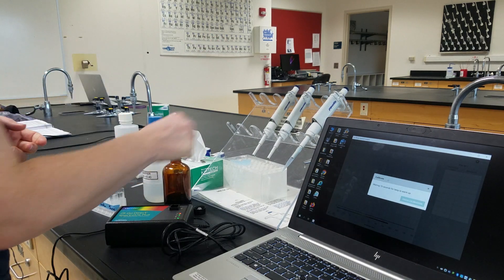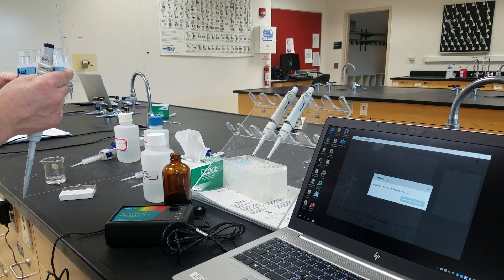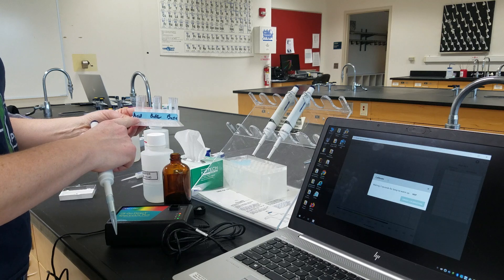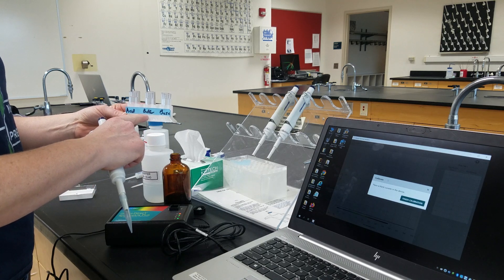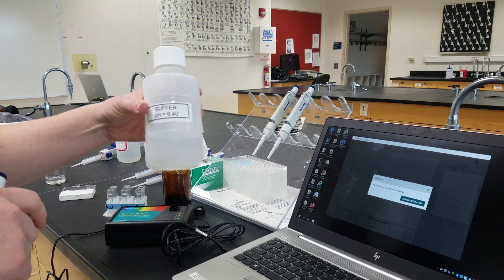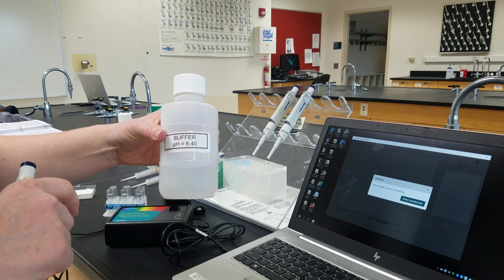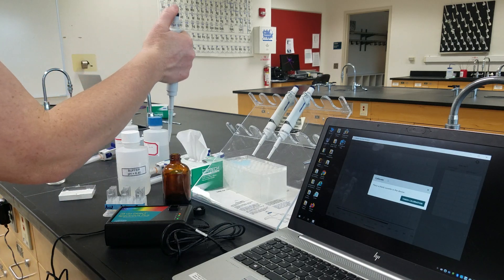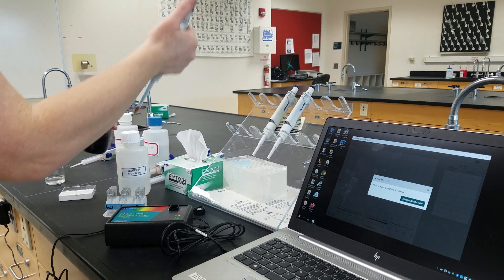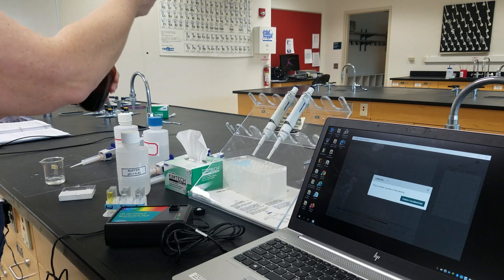I'm going to add my unknown indicator into three separate cuvettes. I've already pipetted in 0.1 molar hydrochloric acid, 0.1 molar sodium hydroxide, and a buffer with the appropriate pH. The buffer we're going to be using has a pH of 6.4. We're going to pipette our unknown indicator into each of these cuvettes.